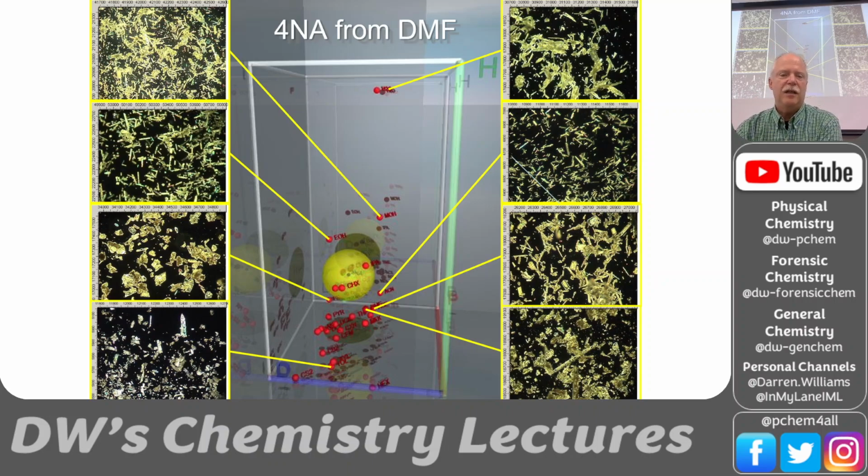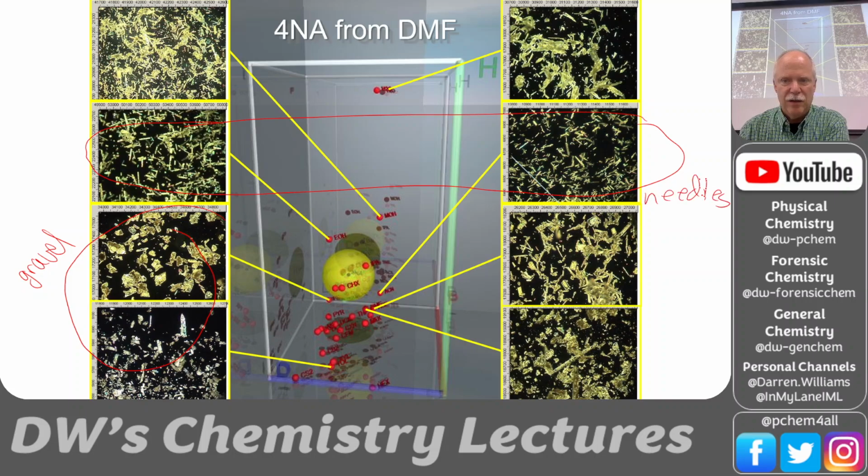Now, these are all of the precipitation paths, just a quick cursory glance. You see, these right here are definitely more like gravel. And this is definitely a mixed bag here, the acetone and so on. But it looks like we got needles over here, like in that. Let's see. Acetone and ethanol, more like needles. And then for water, straight to water, we had irregular.